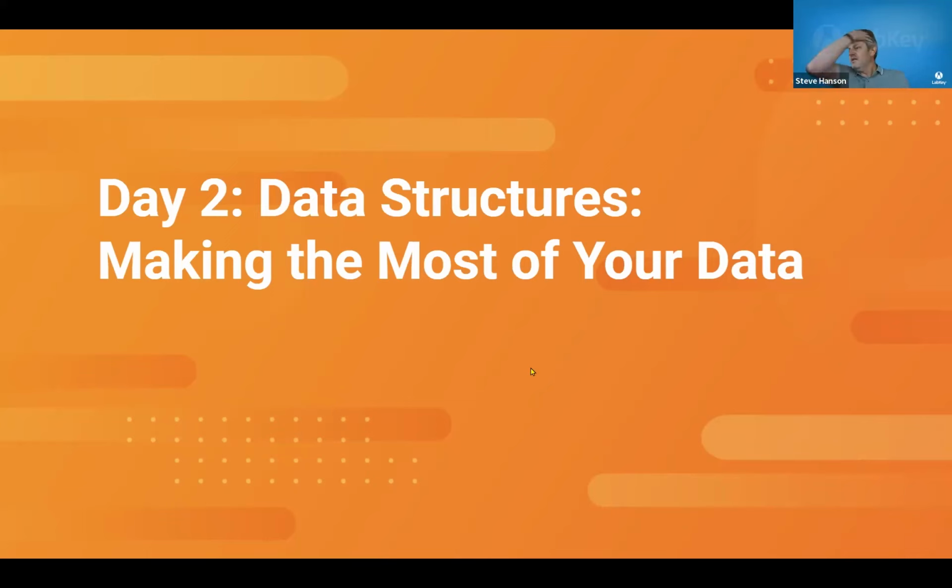All right, let's get back into it. Welcome back, everybody. Let's move on to the second main course of the day, the data structures unit.